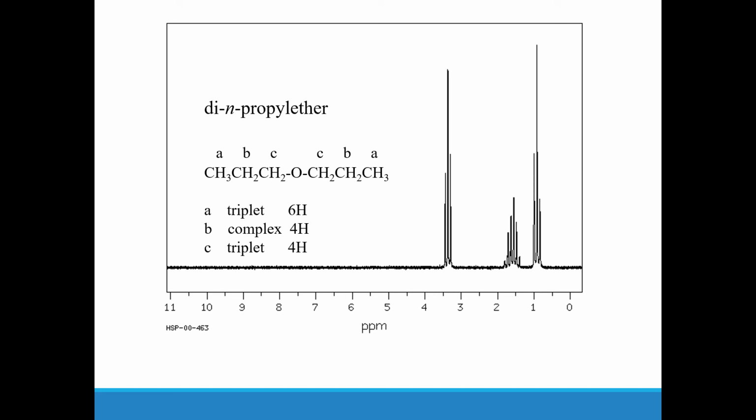Let's start with the easiest one. It's always easier to start further away from the molecule, or further away from the electronegative atom, which is our oxygen. If this is our oxygen, we expect that these hydrogens on the outskirts should be the most upfield. CH3 has 2 neighbors, so it should be a triplet: 1, 2, 3.